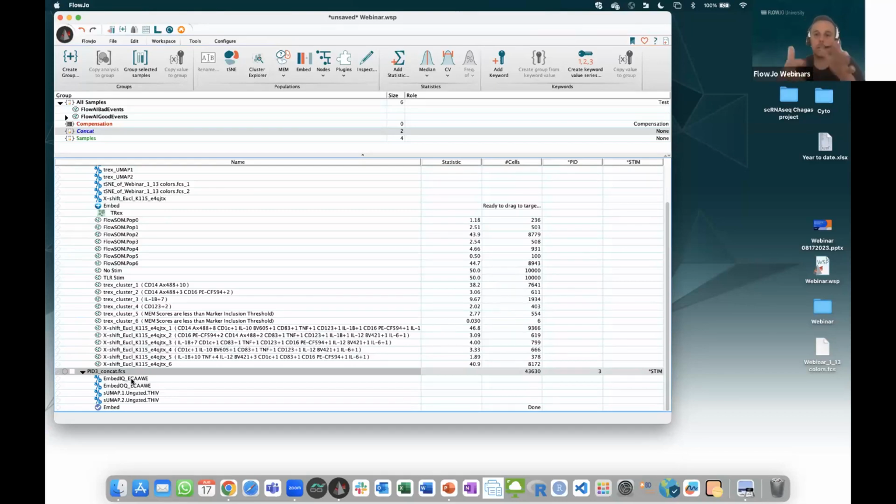We're going to say, okay, out of the 10 times you calculate, 9 times it was cluster 1 and 1 time it was cluster 2. Because it was 9 times cluster 1, instead of just doing an average like cluster 1.1, which is not what we want, we're just going to put it in cluster 1. And we're going to ignore cluster 2, the 1 time we found it. And we're going to do that for every cell and every cluster.